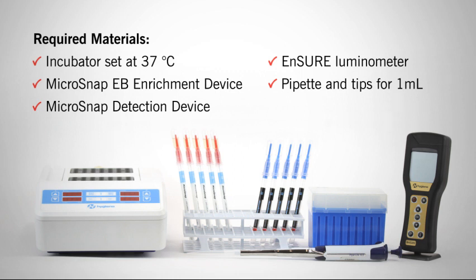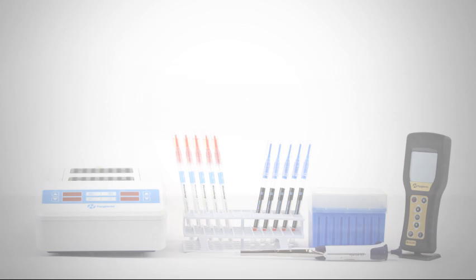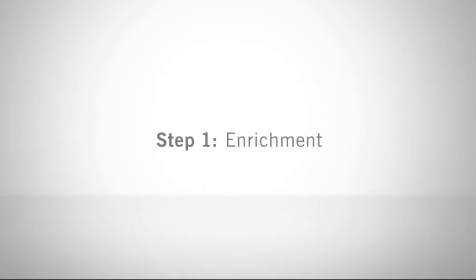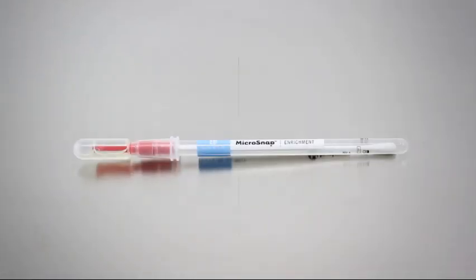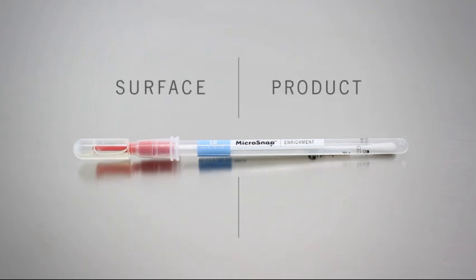Let's get started. Microsnap is a two-step test. The first step is the enrichment step. Microsnap EB can be used to test environmental surfaces, product samples, water, and other filterable liquids.